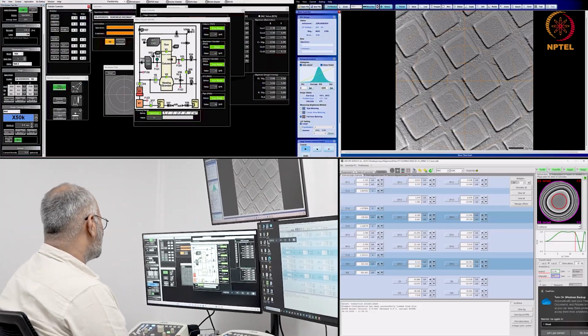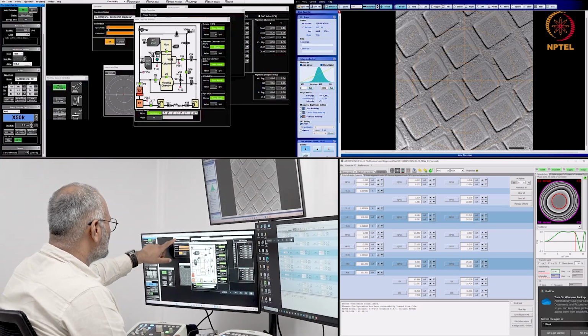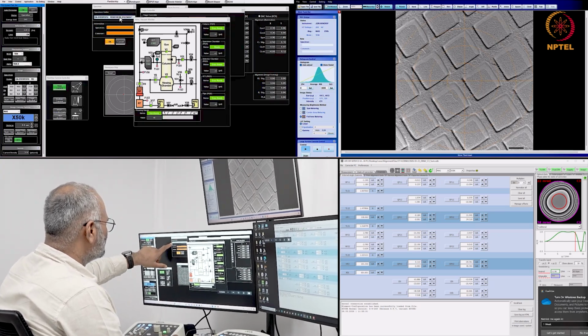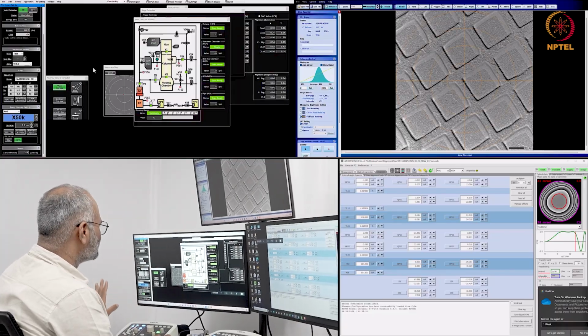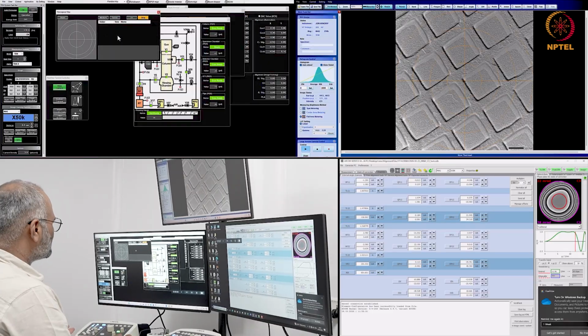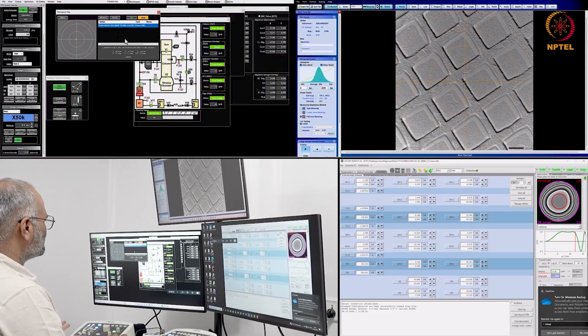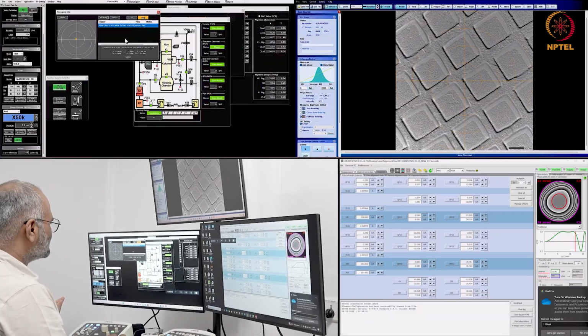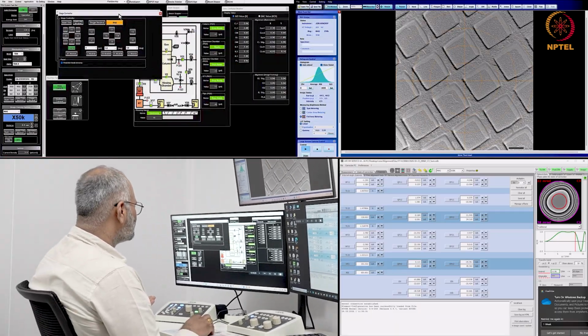You either need it sometimes or you don't need it. And the specimen holder information is here. We inserted the reinforced specimen tilting holder, so that was already selected. And this shows your nanospace map. If I want to store a location of the specimen, I can choose this. If I identify an interesting region in the specimen, I can identify it here. And the stage controller is here.